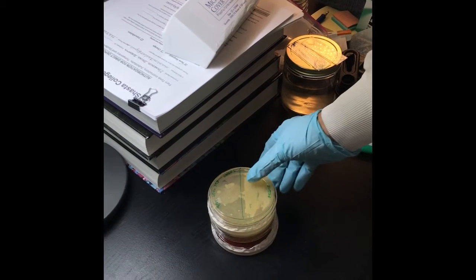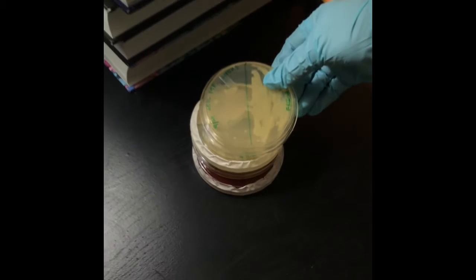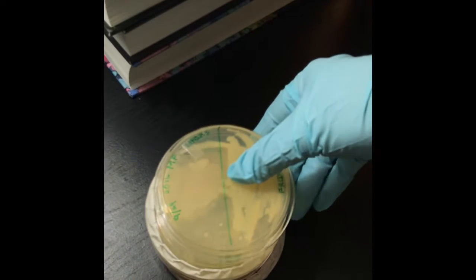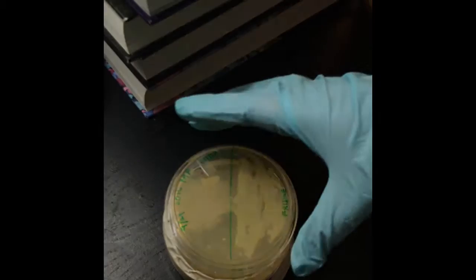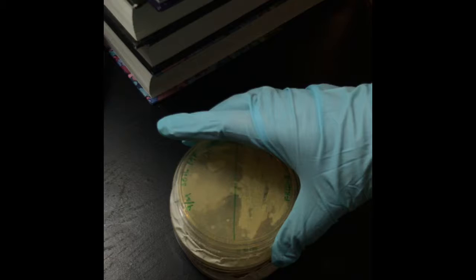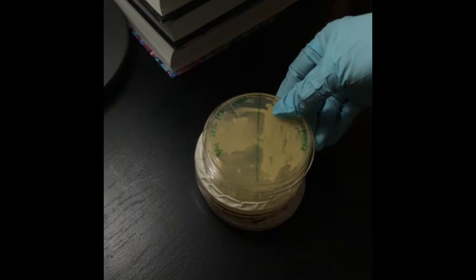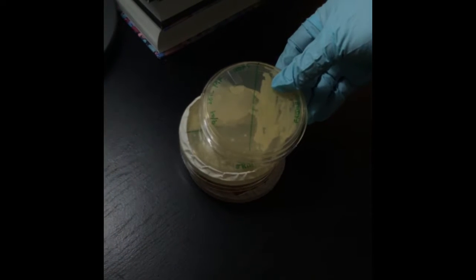Hi, today I have come to show you the results of the ubiquity of microorganisms. I did the streaking of the plates, or infecting the plates, with the environmental sample in TSA, SDA and blood agar plates. So I'm going to show you how it appears. Maybe you'll find it interesting.